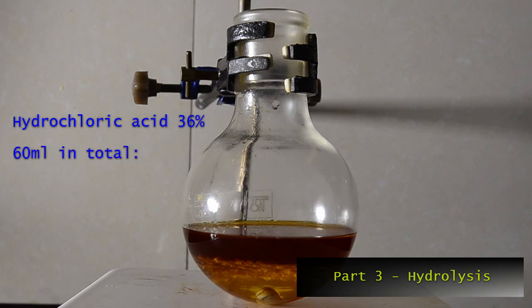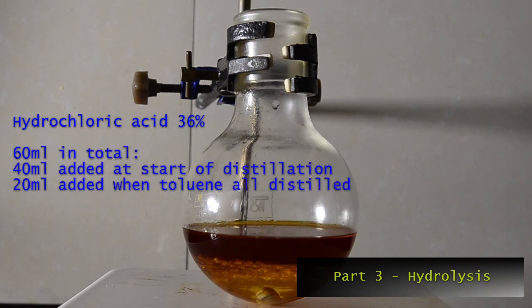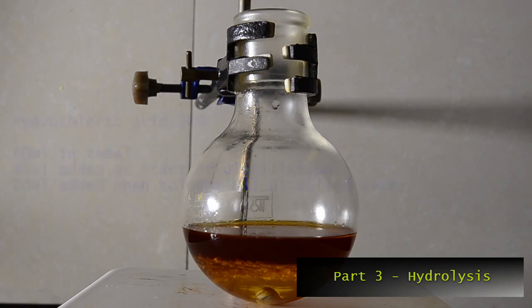The next stage of the reaction is to hydrolyze the mandelonitrile. Add 40 milliliters of concentrated hydrochloric acid to the flask. This will form a lower layer.